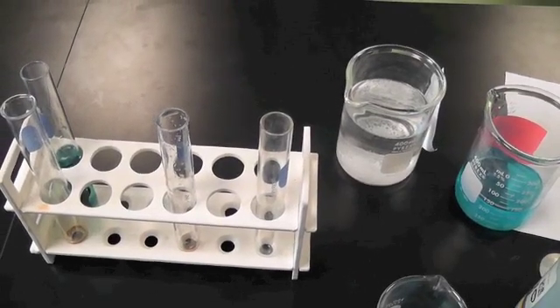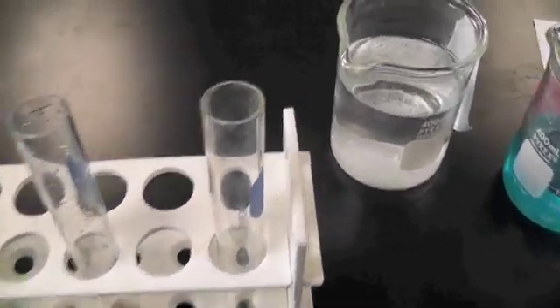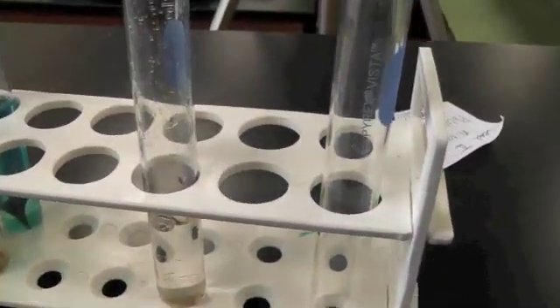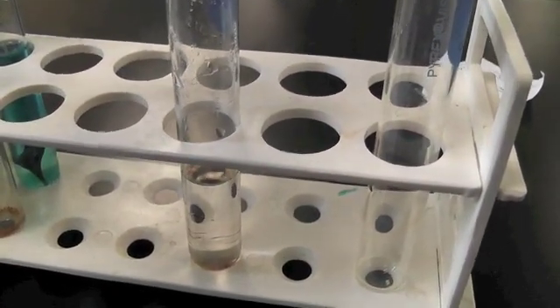You might be thinking this will happen with anything — just put any metal in there. But of course, that's not true. Let's take the same lead nitrate solution, pour it back into this test tube, and instead put in a piece of copper. Here I have a piece of copper and we'll put it into the lead nitrate solution.